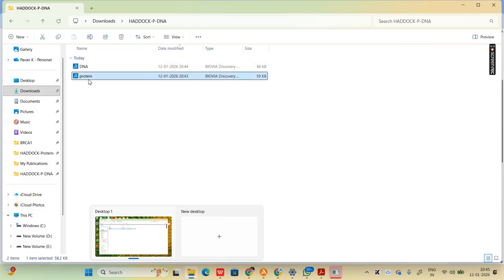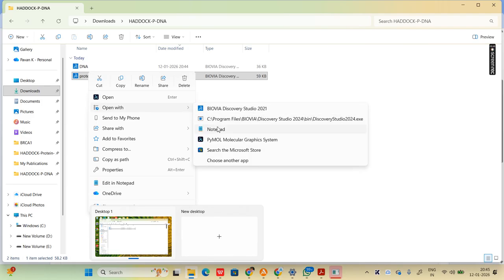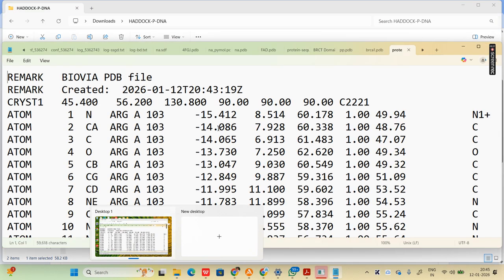So we are taking the protein molecule and we have to open it in the notepad. So one of you, those who are good at programming, you guys can write a program. So as such, once you upload the PDB, that will automatically remove the B files. Okay, like the B conformation data, like whatever I am deleting manually, so that has to be automated. Okay, so you can write some program that could be also one decent project.